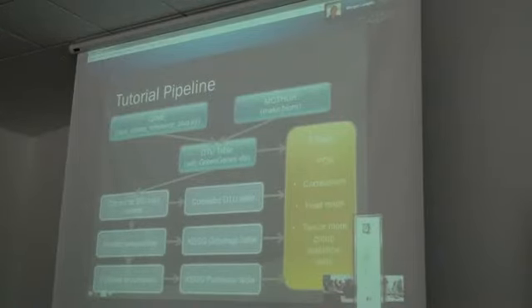Okay, great. So now I'm going to move on to the demo of it, and we can always come back to more questions after. The brief tutorial that I'm going to walk through assumes that you've already created an OTU table with either QIIME or mothur, with the restriction that it has to have these Greengenes IDs. As I mentioned already, this would be using closed reference OTU picking, or in mothur they have this make.biom file.